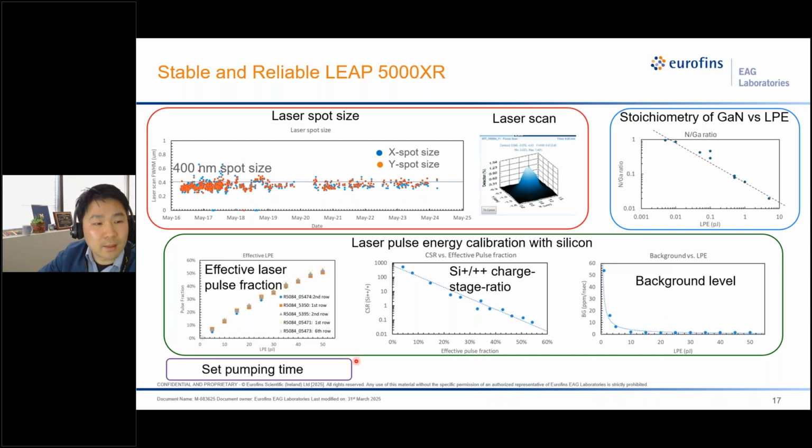We also have a very strict rule for the pumping time to ensure the best vacuum quality. Usually we set the sample in the chamber at least 4 hours in the load lock and 4 hours in the buffer, so it won't suffer from higher background due to poor vacuum quality. We are also very grateful for the good service from Cameca in the effort of reducing the downtime for our instrument.